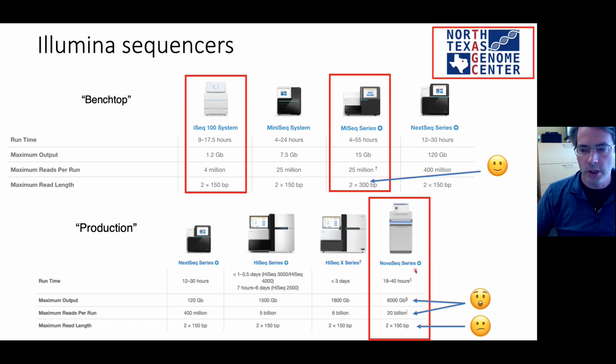Part of the trade-off, just a last note here, is that things like the MiSeq that are not giving you very many runs, the MiSeq in particular, can give you 300 base pair single reads. Okay, so you can go up to 600 base pairs of actual sequence on a given fragment, right? So this is 2x300, right? Remember that's paired end 300. You've got 300 base pair reads on both ends of your fragment. That's as good as the Illumina technology can do.